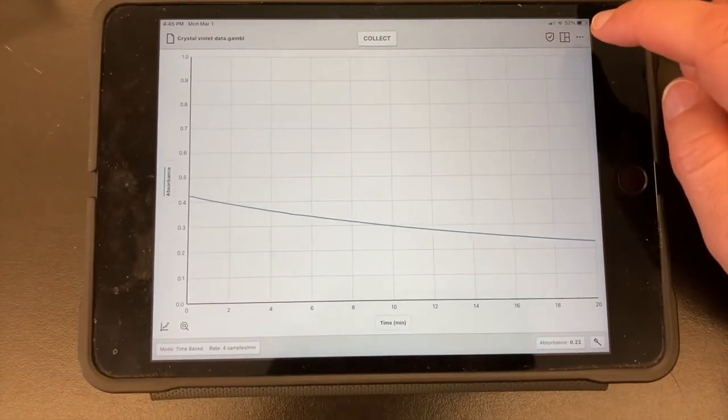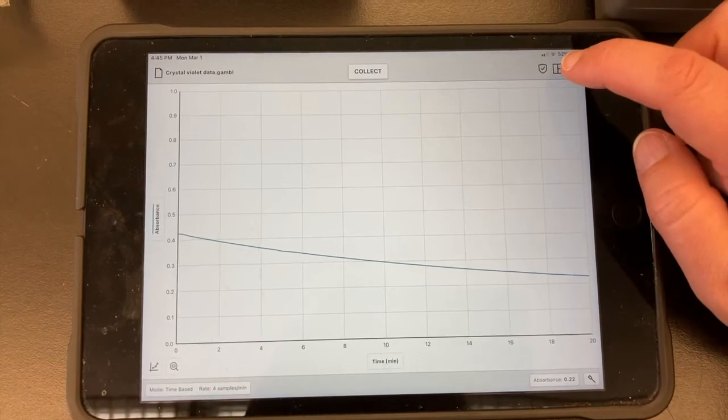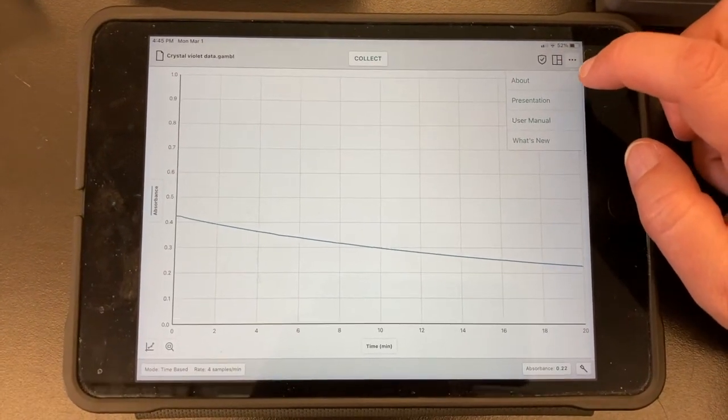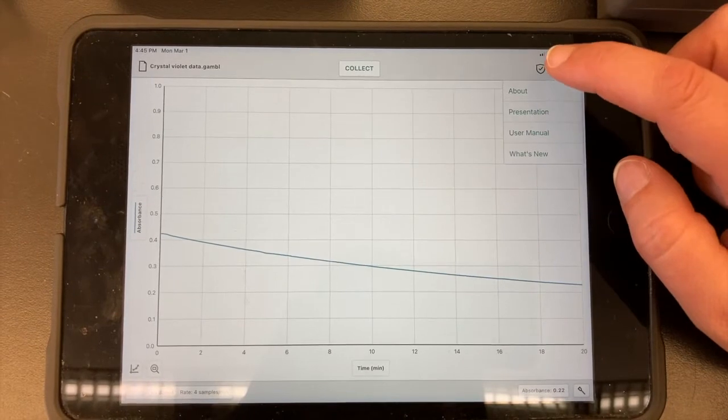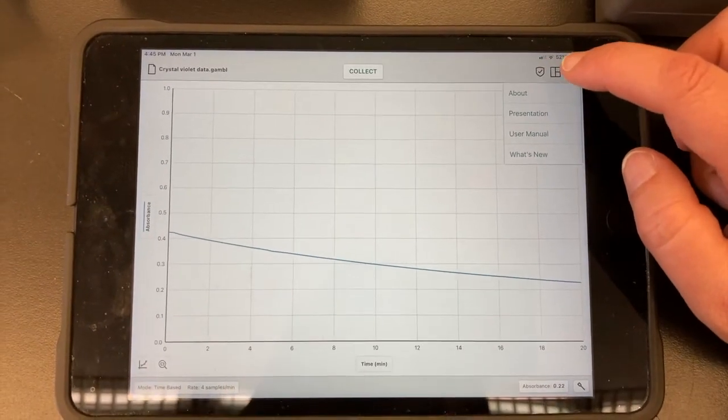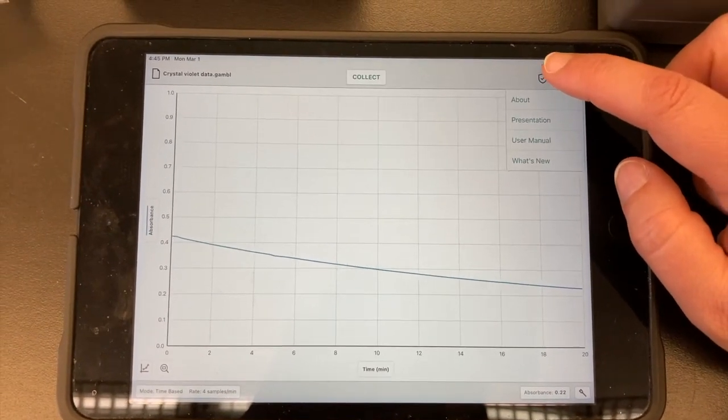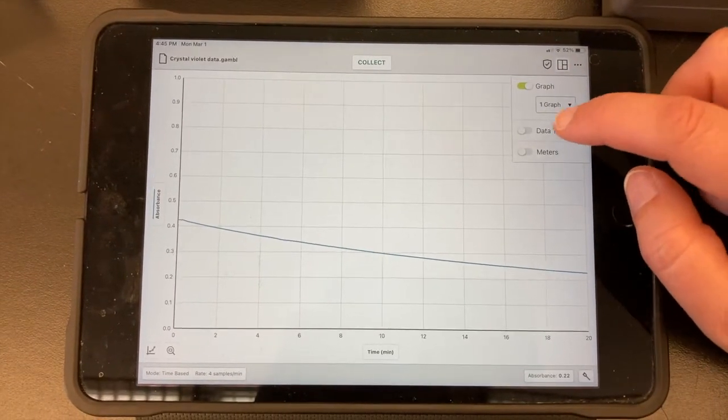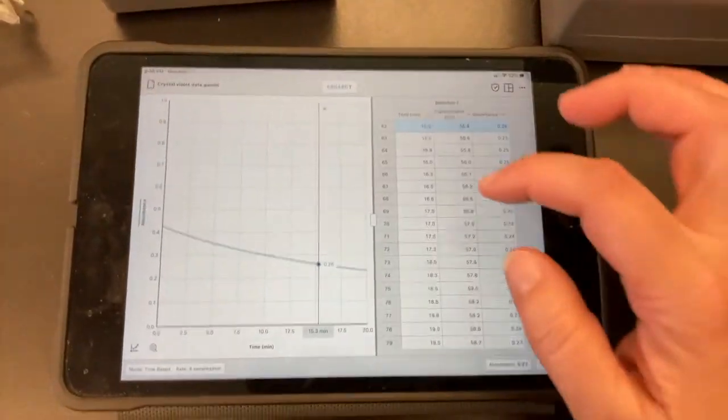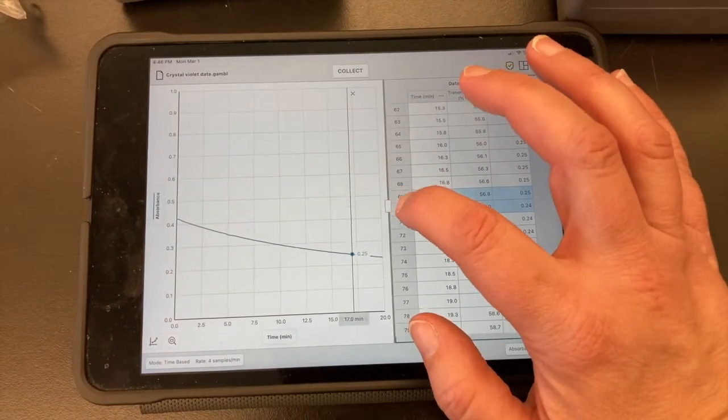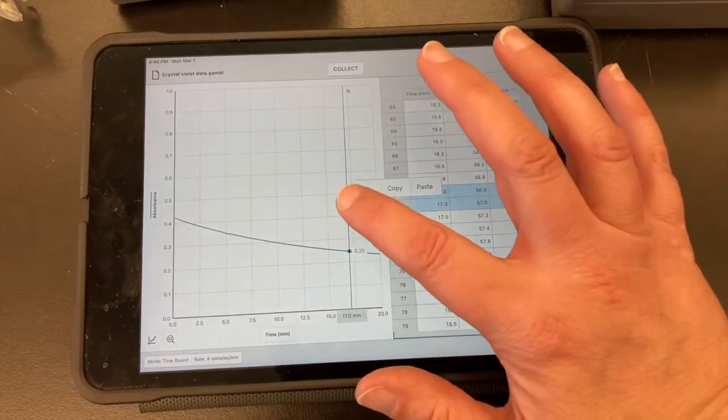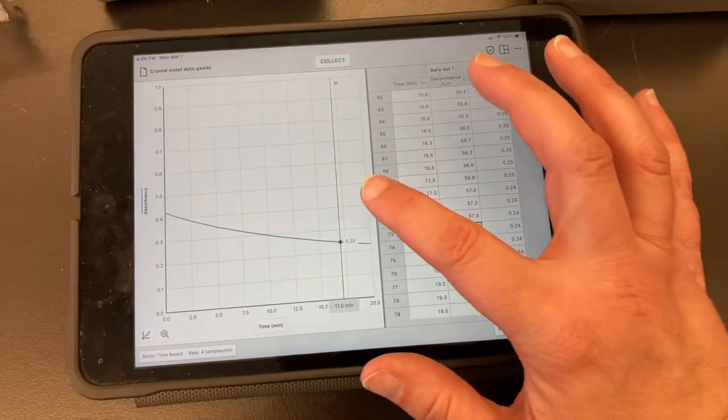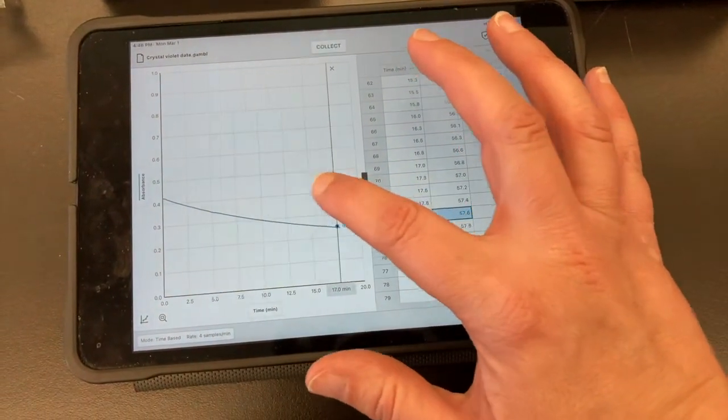Once your data collection is complete, you are going to need to set up your data table so that you can do the analysis. What we want to do is click this button in the corner that has the rectangle and two squares. And we want to see a data table. So I am going to move the graph out of the way for the moment so we can add our extra columns.